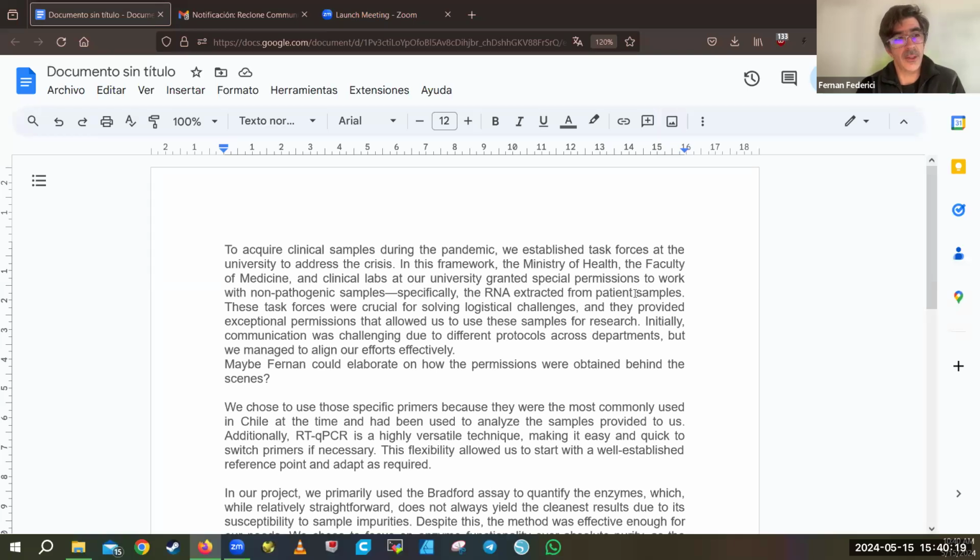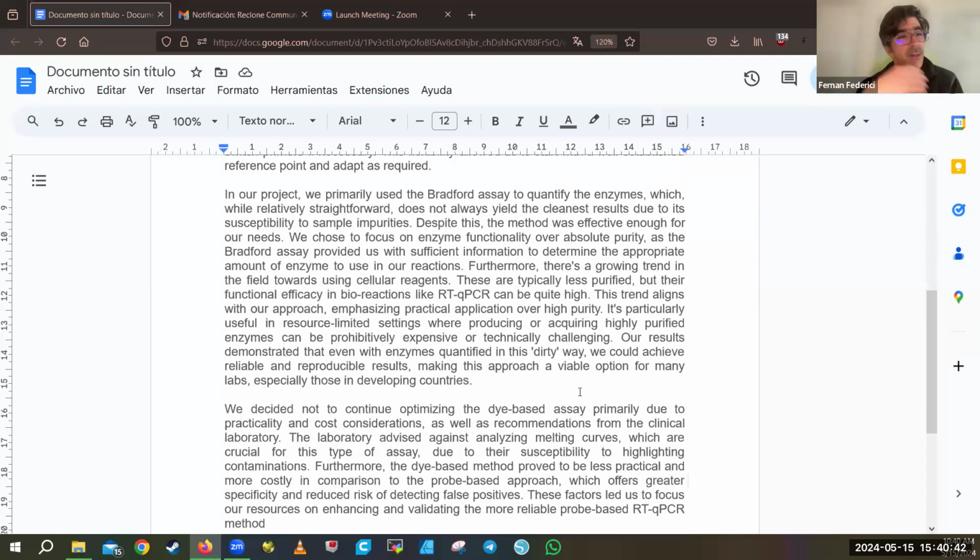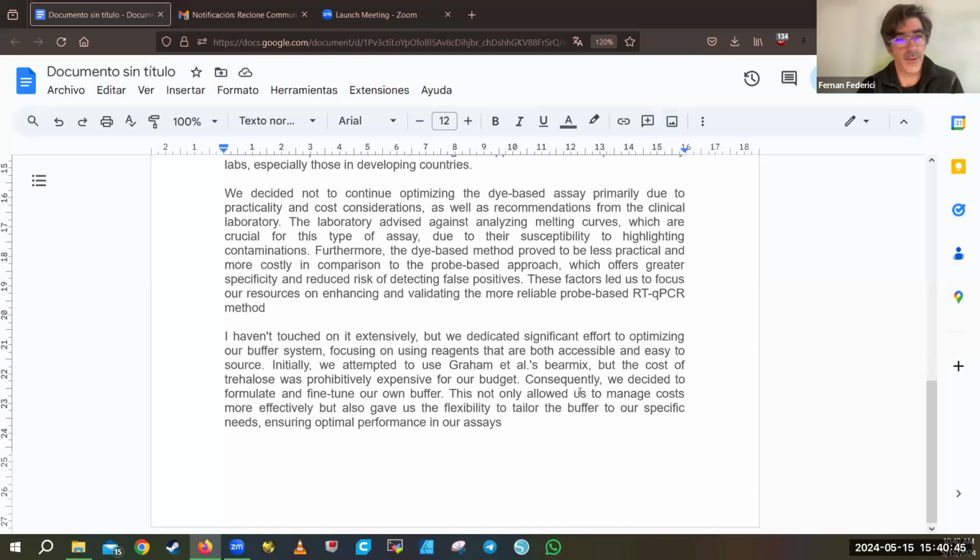And I should mention that now we are trying to expand the use of these resources in other universities, for example, collaborating with people in Argentina to create open educational resources, combining the enzymes and the open hardware devices created by the community, others created by people in Argentina, others created by people here, like colorimeters, thermocyclers, and other machines.